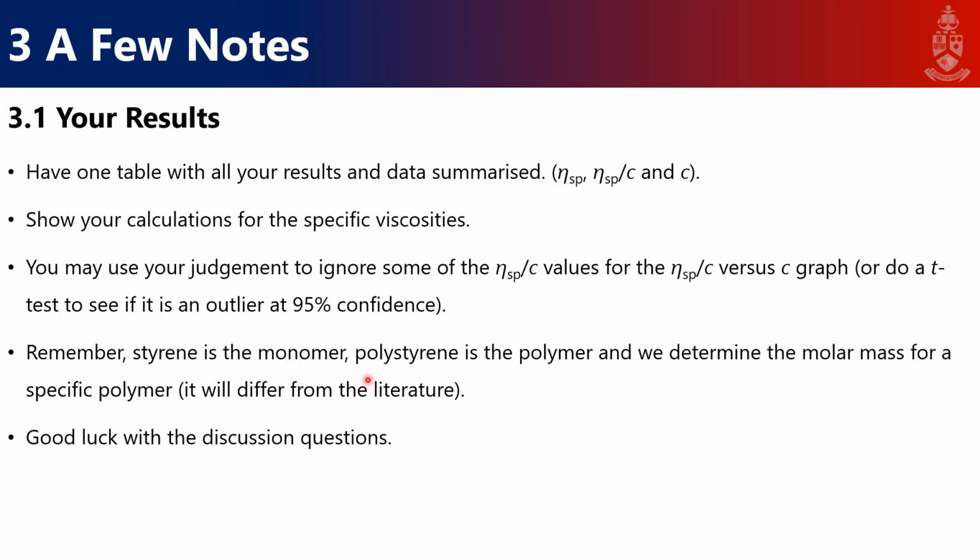So that is why your answer is going to differ from whatever you obtain in literature. The polystyrene that we have is going to differ from something in literature. So it's not really directly comparable to literature unless you bought it from exactly the same source, the same bottle, the same manufacturer, whatever. Then you're not going to link up the same number of monomers, you understand?